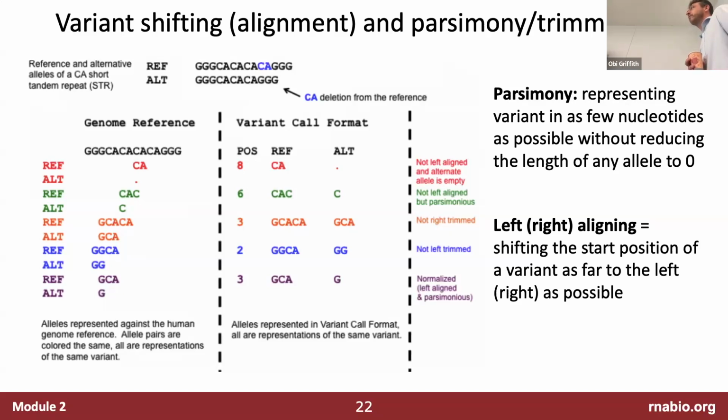So we still use mostly CanFam, even though CanFam 3 is the latest popular stable release, even though it's vastly inferior to some of the builds that have come out since, because some of those downstream steps haven't happened. Ensembl hasn't made a proper release of annotations for some of the better reference genomes. Top level files for anything else. Exactly. Or there's no VEP cache, or there's something you need in your pipeline that's missing. I share your frustration. That's just how it is when you're working with model or companion animal systems. You're always having to find workarounds.